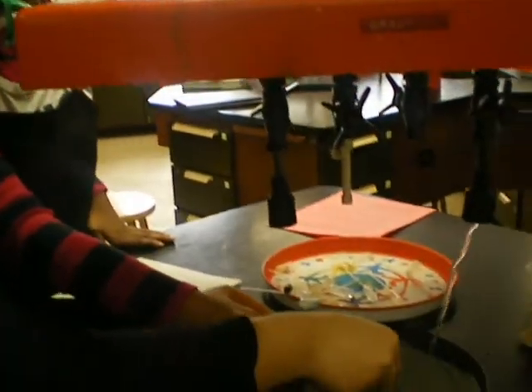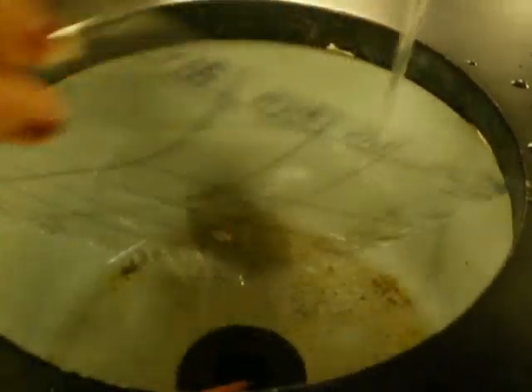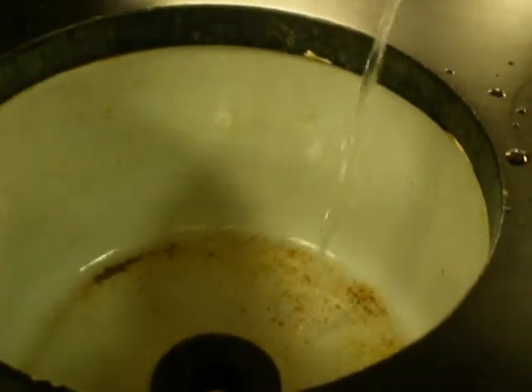When cleaning up, you just want to wash all the compounds off, and make sure that you get all of it off, because they are toxic, and if you still touch them, then you'll get burned. Residue like that, you can just take a paper towel and wipe it off, like so. And then just wash it off again.